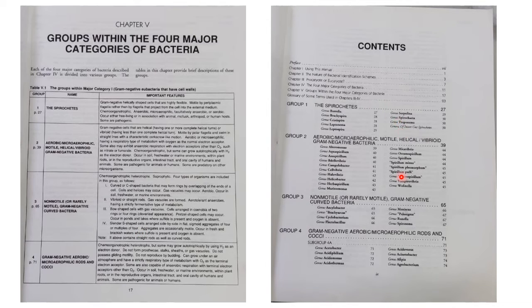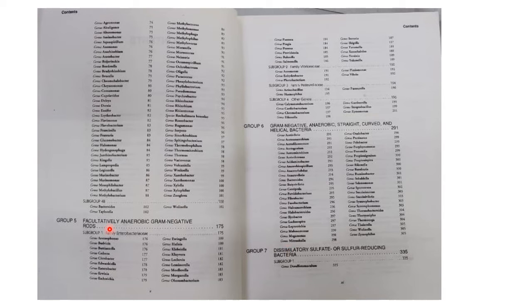Okay, so you can see this is the content. First group is spirochetes, second is aerobic, microaerophilic, motile, helical, vibrioid, gram negative bacteria, third is non-motile, gram negative curved bacteria, fourth is gram negative aerobic or microaerophilic rods and cocci. Then comes facultatively anaerobic gram negative rods. You can see below these groups the list of genera is also mentioned. Even some groups have subgroups.